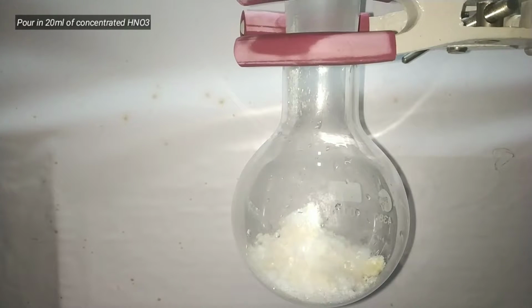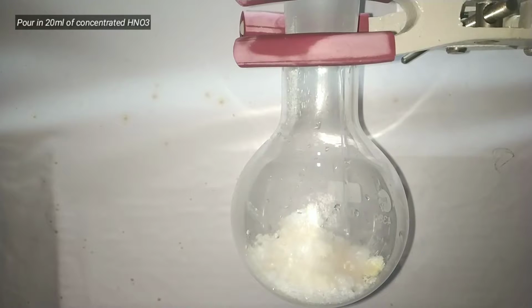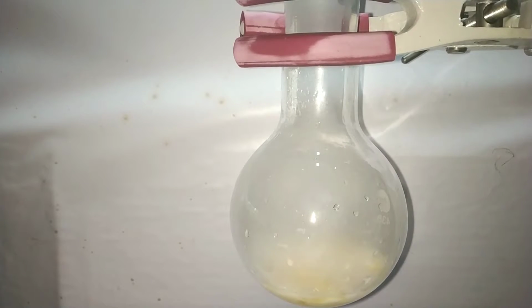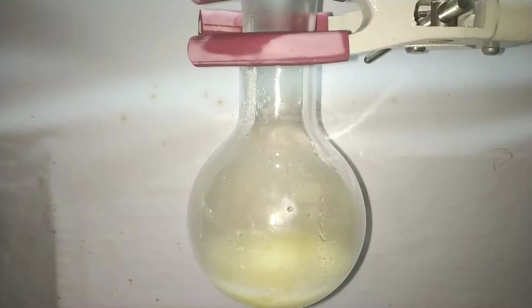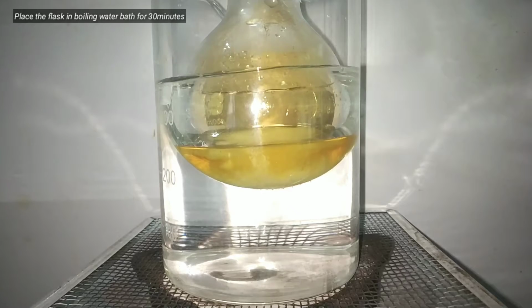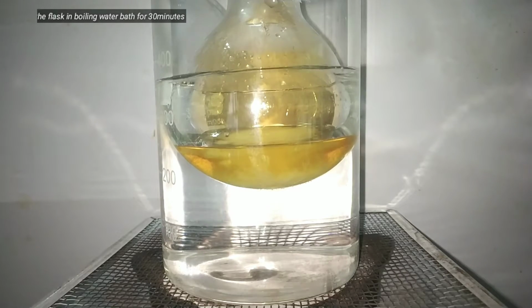Now, add the pre-measured 20 milliliters of the 70% nitric acid into the flask. The reaction has already begun at room temperature a few minutes after the addition of the acid. Keep the flask in a boiling water bath for about 30 minutes with temperature at 100 degrees Celsius.